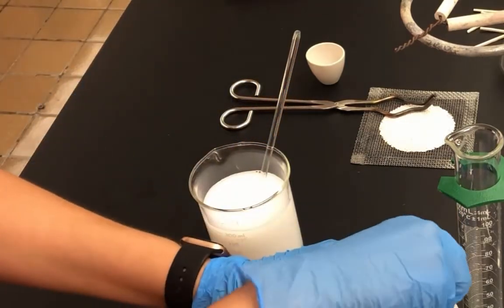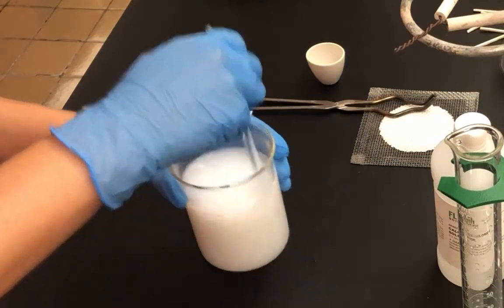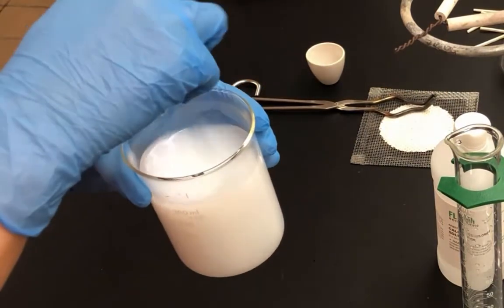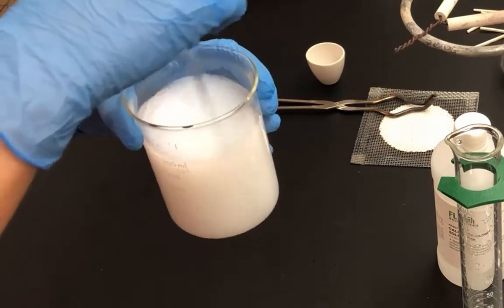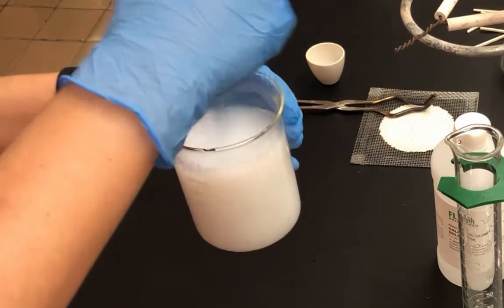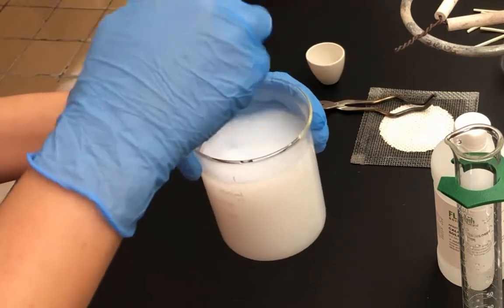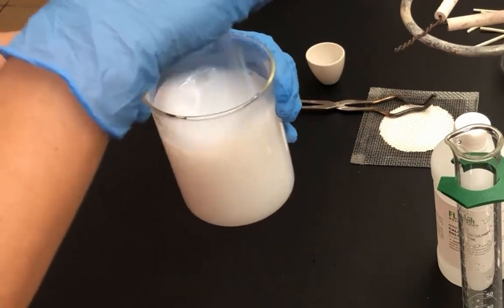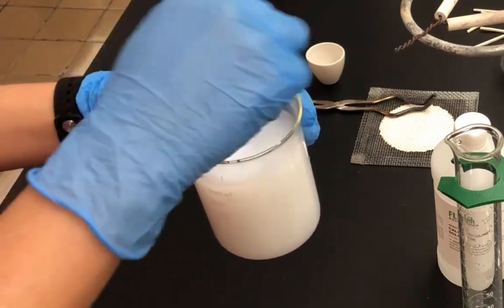And we want to go ahead and stir this solution. Make sure you're recording your observations. You should notice that something happened here. Now we're going through a precipitation reaction between CaCl2 and this M2CO3, where M means either K or Na. I'm just stirring, making sure that reaction proceeds to completion.